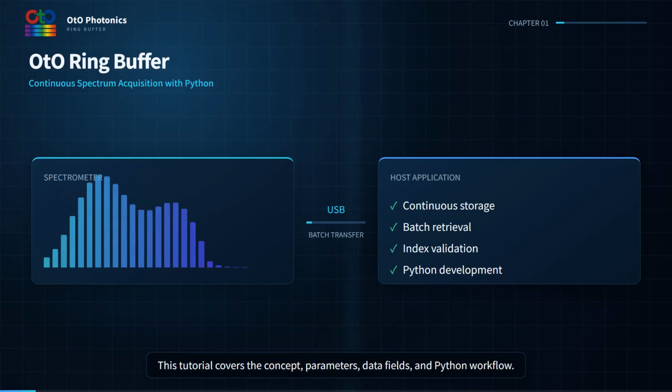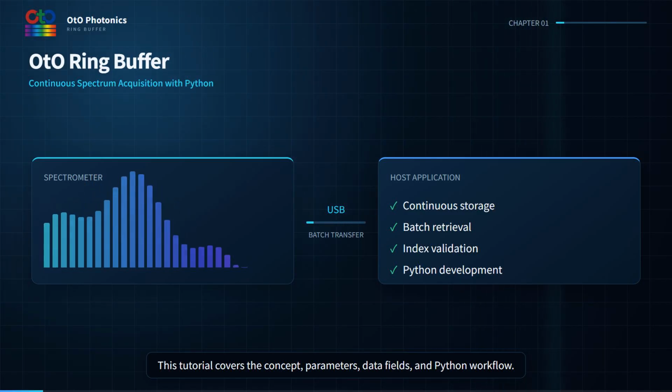This video explains the ring buffer concept, key parameters, data fields, and important precautions. It then demonstrates the complete workflow with a Python example.